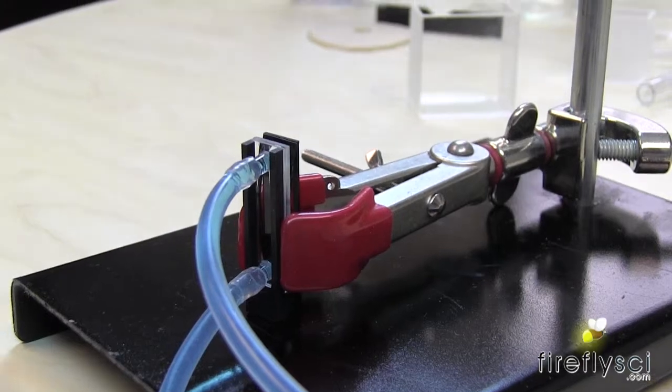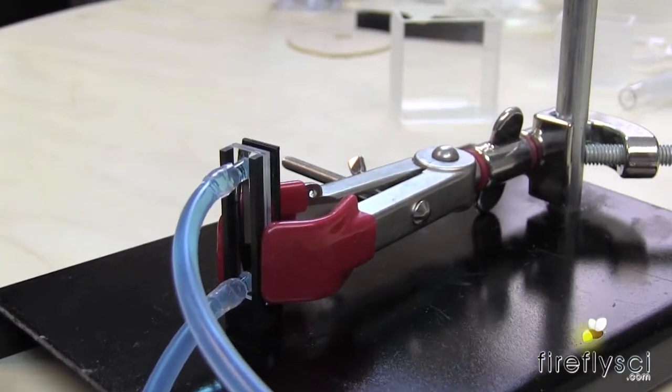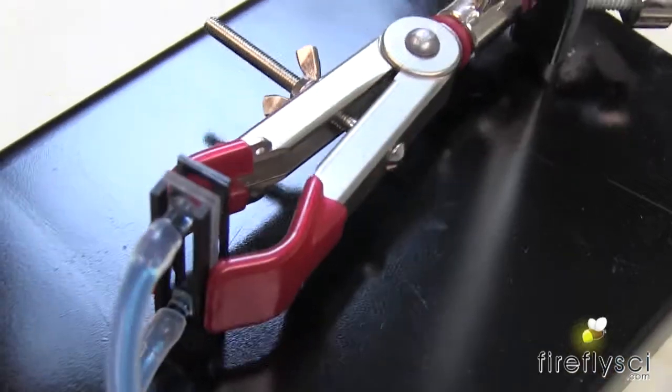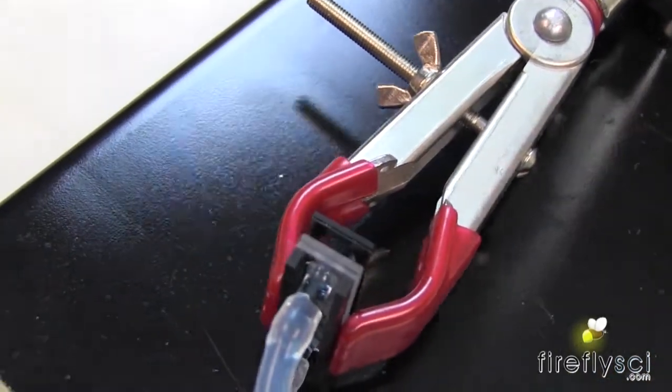Okay, so I have sample running through the cuvette and I just want to highlight that there is no leakage coming from any of the sides.